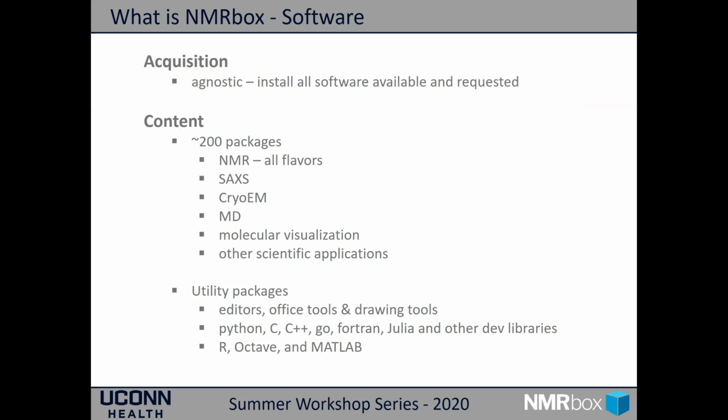We have over 200 different software packages covering all flavors of NMR, from data processing to relaxation analysis. We have software packages for SAXS, cryo-EM, molecular dynamics, molecular visualization, and whatever other scientific applications are needed or are used in conjunction with the various other software packages we have installed. We also have a lot of utility packages included, a variety of editors. So hopefully everybody's favorite text editor is in there, drawing tools, programming languages across the board.